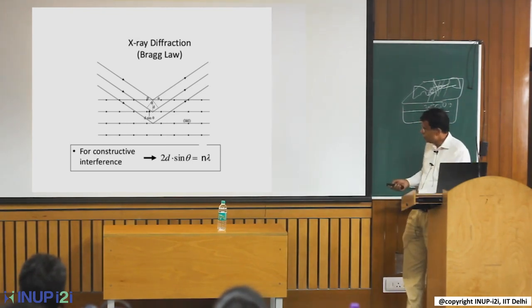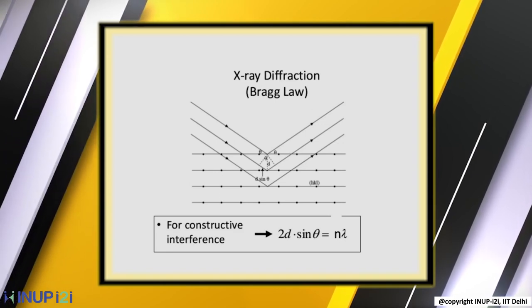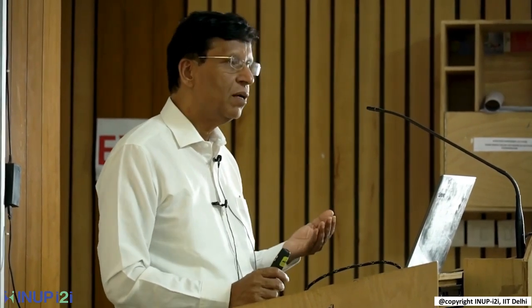The plane spacing d is related to the lattice constants a, b, c. So if you have a material with, say, a cubic structure, a = b = c, and from that you can find the angles at which the peaks will appear. Theoretically one can work this out, and nowadays many programs are available which help calculate these things.